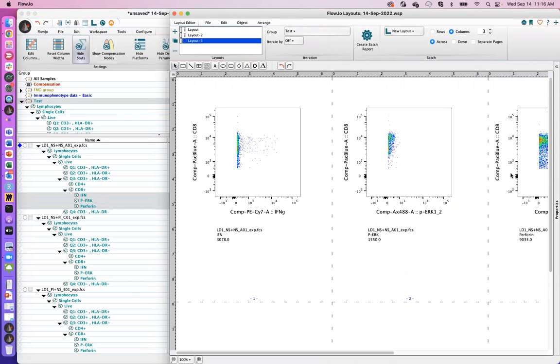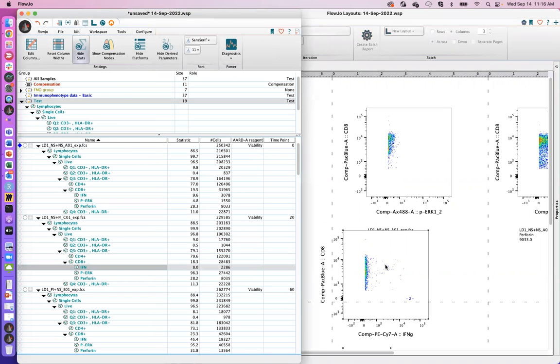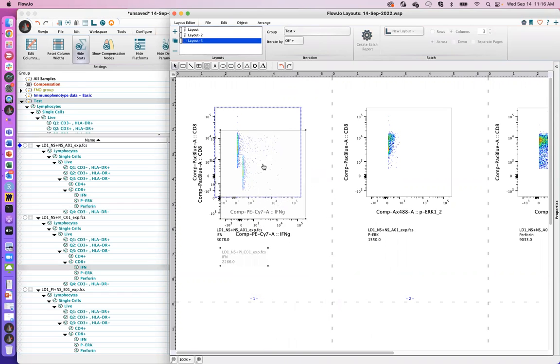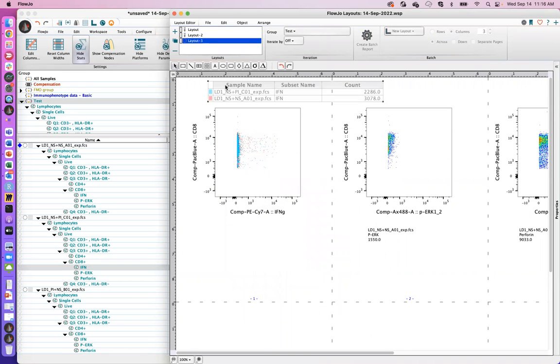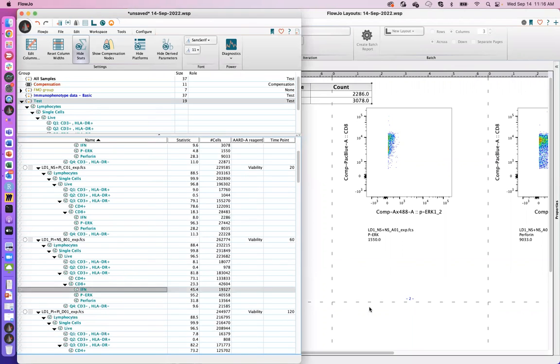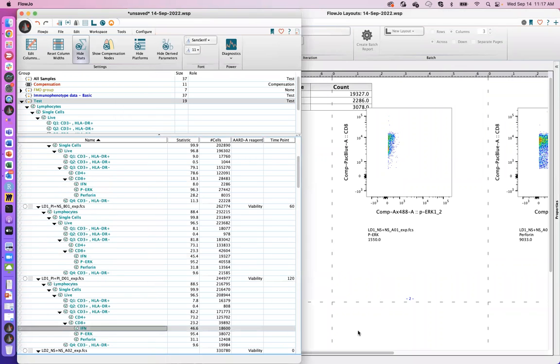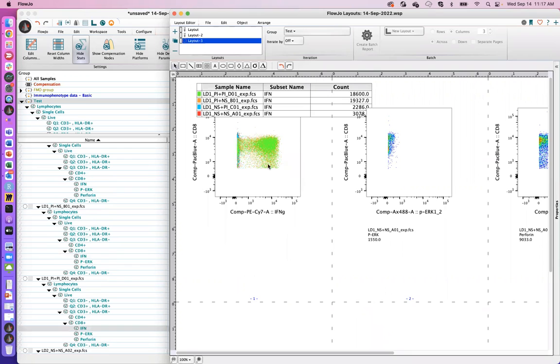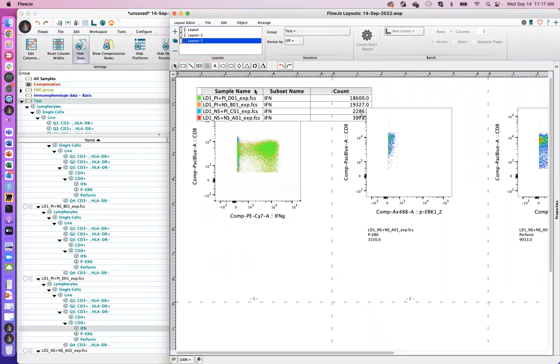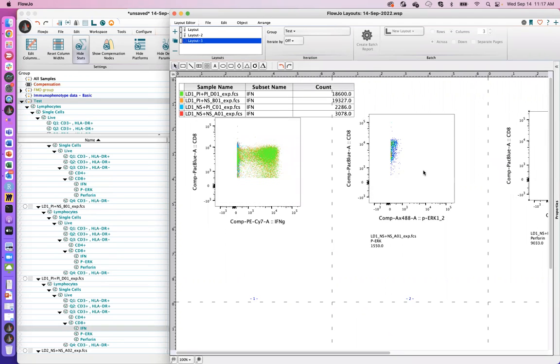Normally what I'm going to do here is bring my terminal populations out, and then I can just go and overlay them with their subsequent files. For example, here I've just dragged in the second sample, which corresponds to the 20-minute time point. Then I can do the same thing with the third one, and then with the fourth. We can see with the third and the fourth, it looks like there's some interferon action happening. What about with phospho-ERK and with perforin?